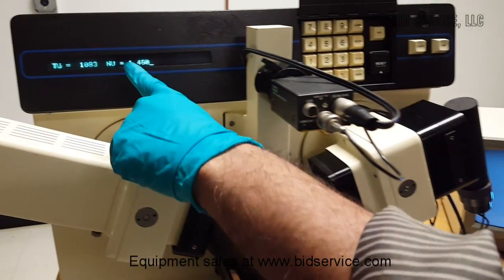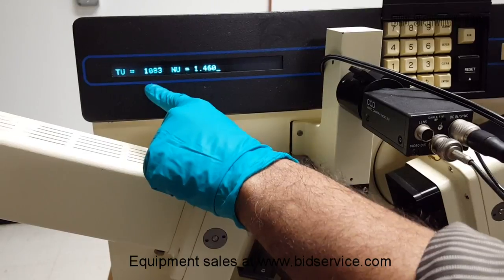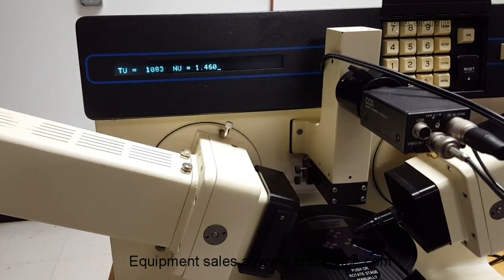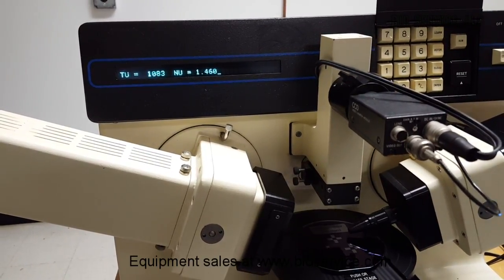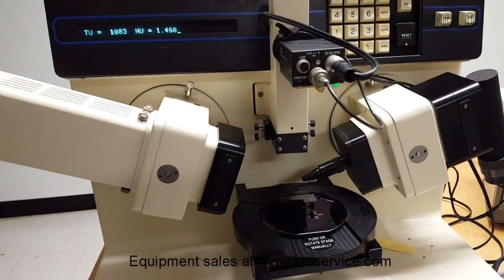Here the system calculated both the upper layer thickness, which is 1083 angstroms, and the refractive index is about 1.460. Now I'm going to load a second wafer with a different thickness and do the measurement.